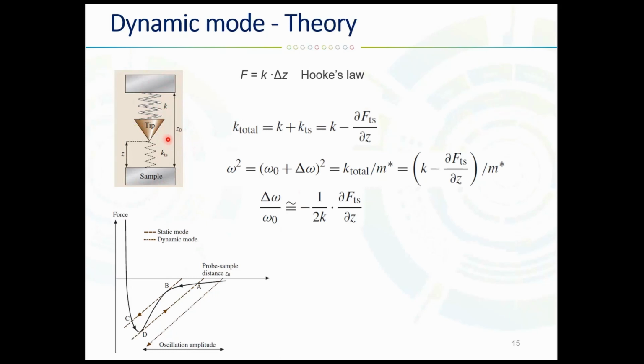Please don't forget that the force interaction spring is not constant, and it depends on the distance Z between the tip and the sample. The derivative of the force represents the spring constant K_TS here. We will use this constant to calculate the oscillation cycle.